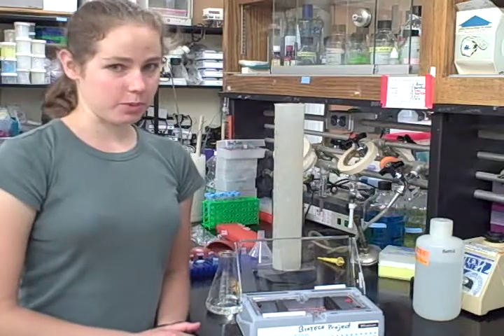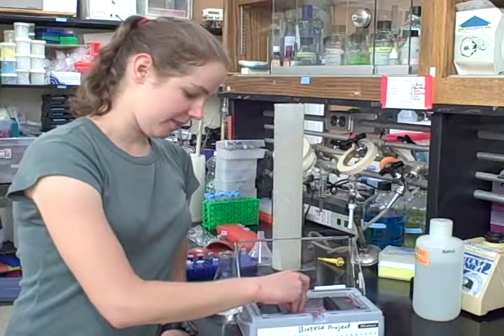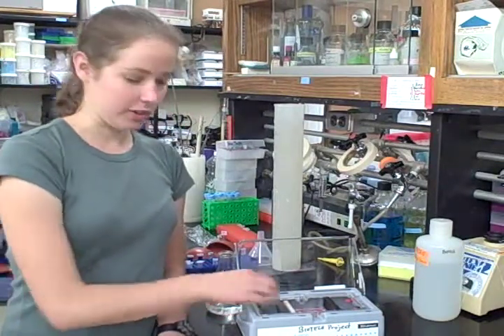As soon as the gel is poured and before it solidifies, take the comb and place it into the gel. Put it on the side of the gel close to the negative electrodes.